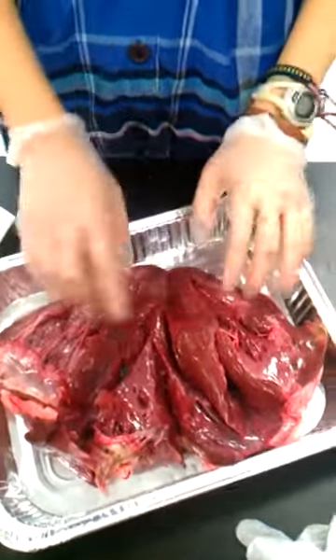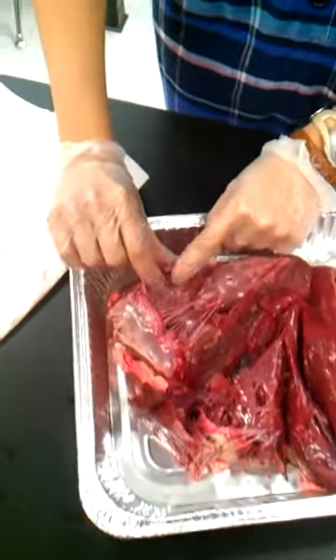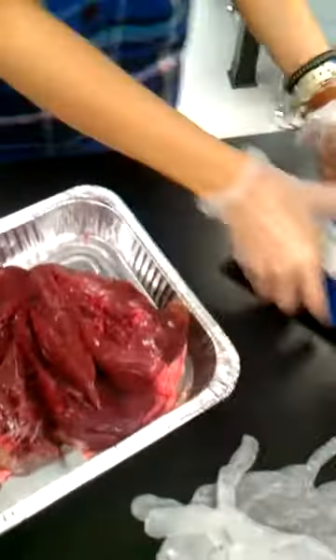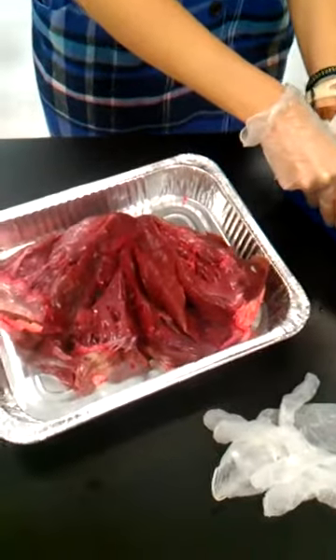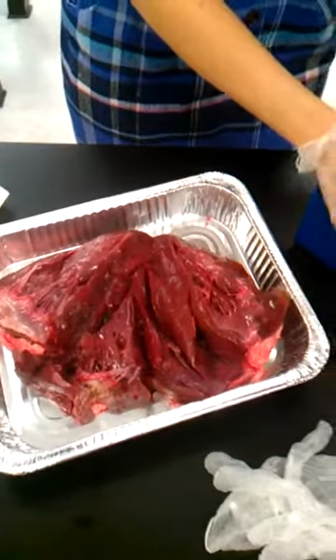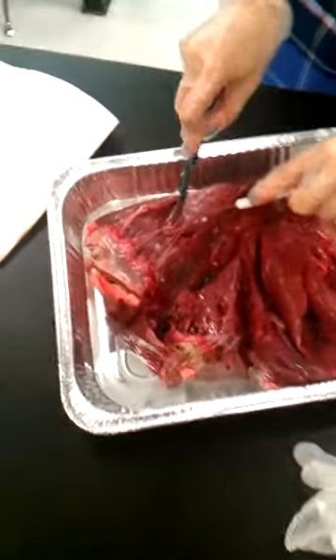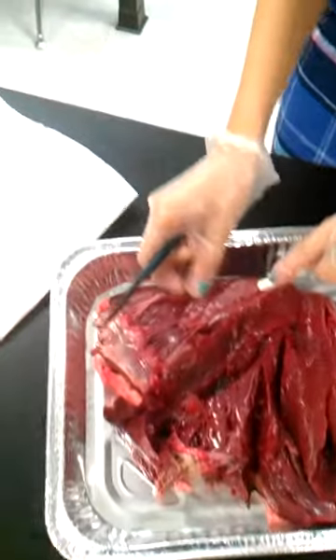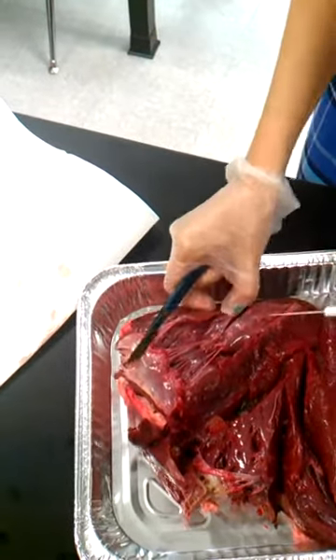So basically you just see that there's two sides, there's lots of different sections. I'm actually going to cut some of these open and we're going to see if we see some good stuff. So we have some sharp blades. We'll have to rinse all of these off, but so if I cut through here, cut through this tissue here, I just wonder what we'll see.